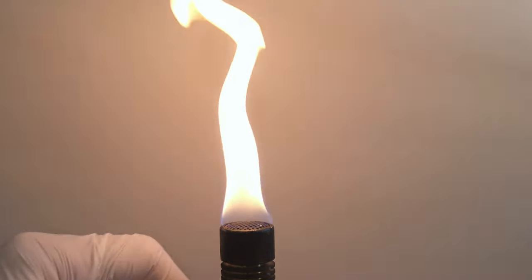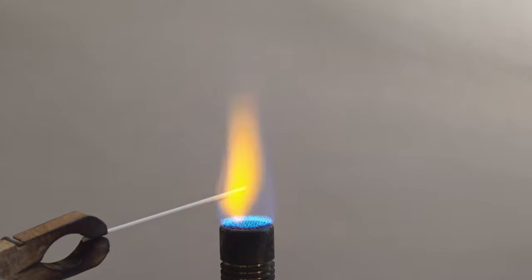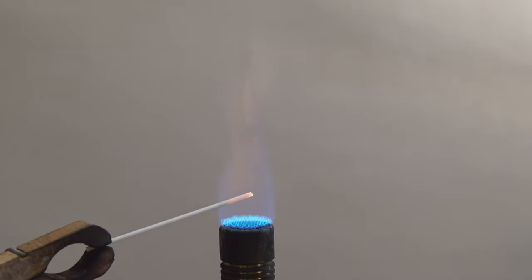To find out whether sodium and potassium are present, the flame test can be done. For this, a platinum wire or a magnesia stick is used. This is heated for a short while to lower the usual contamination with sodium salts.